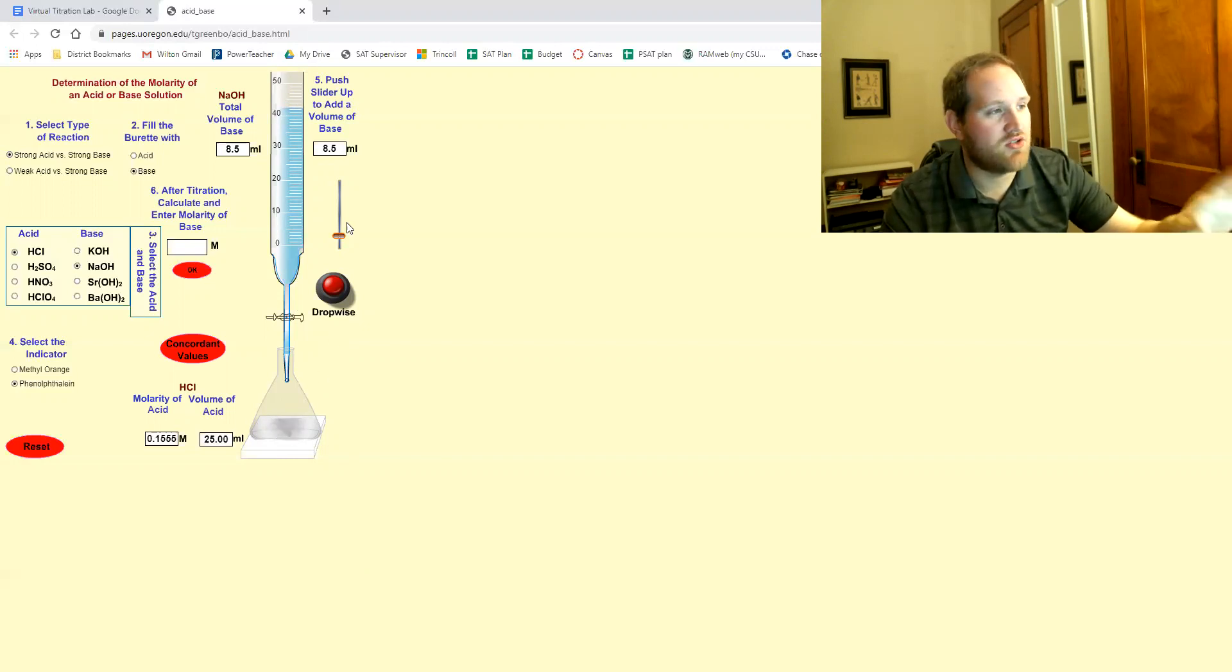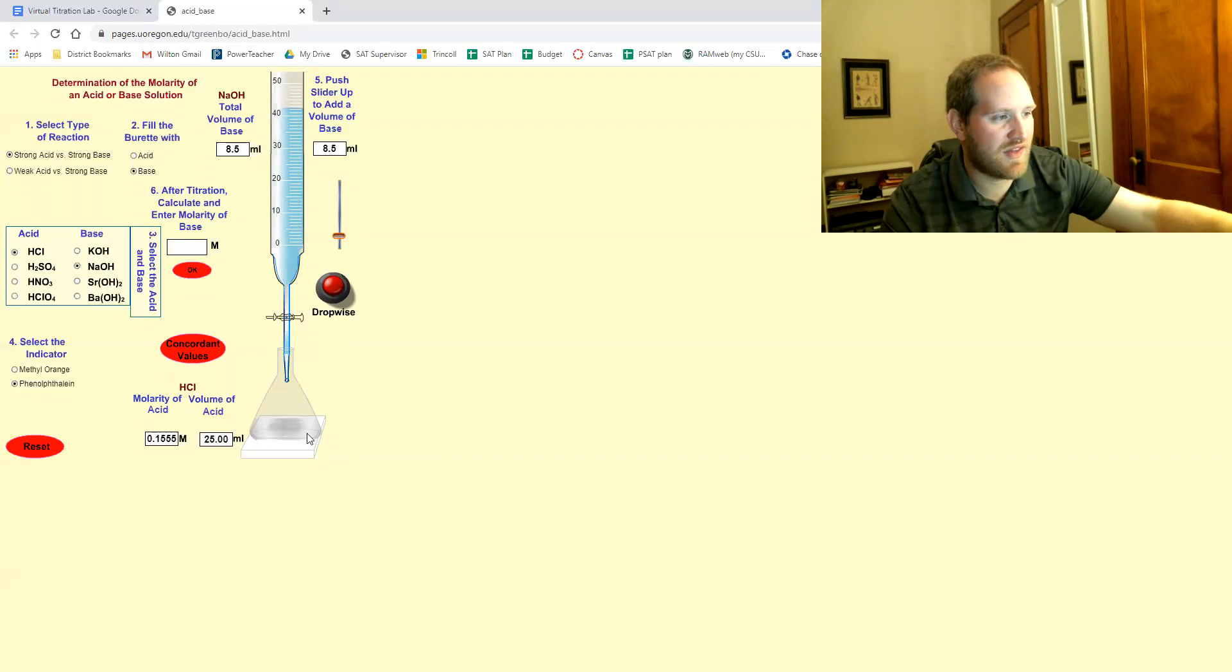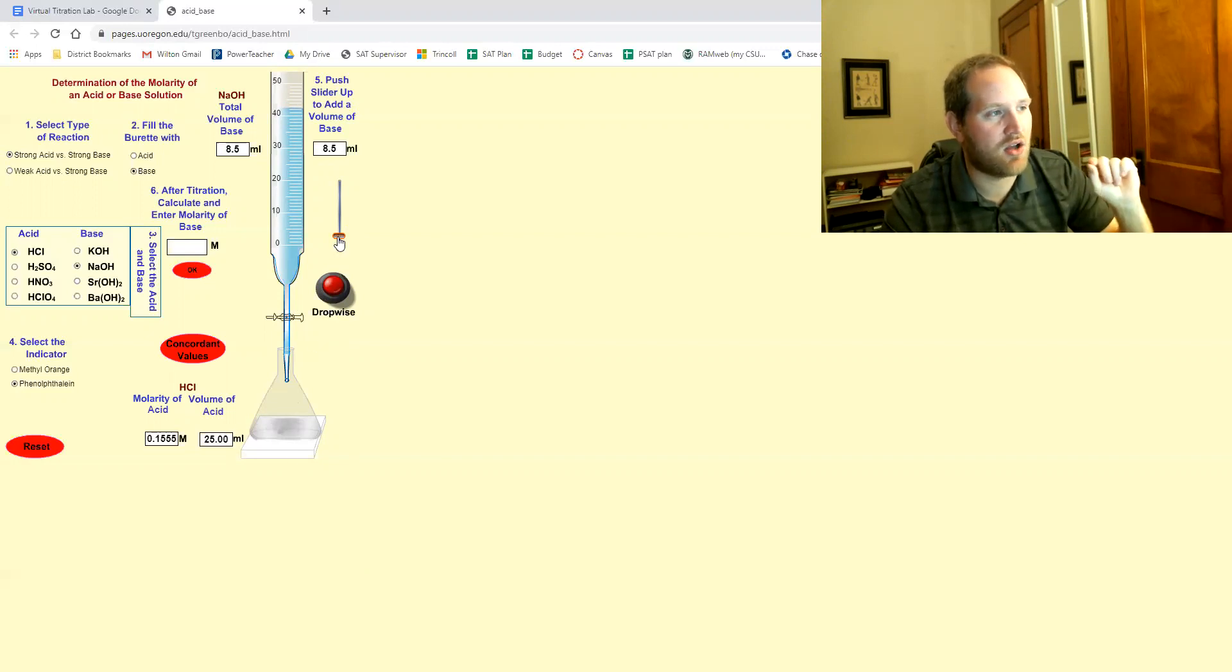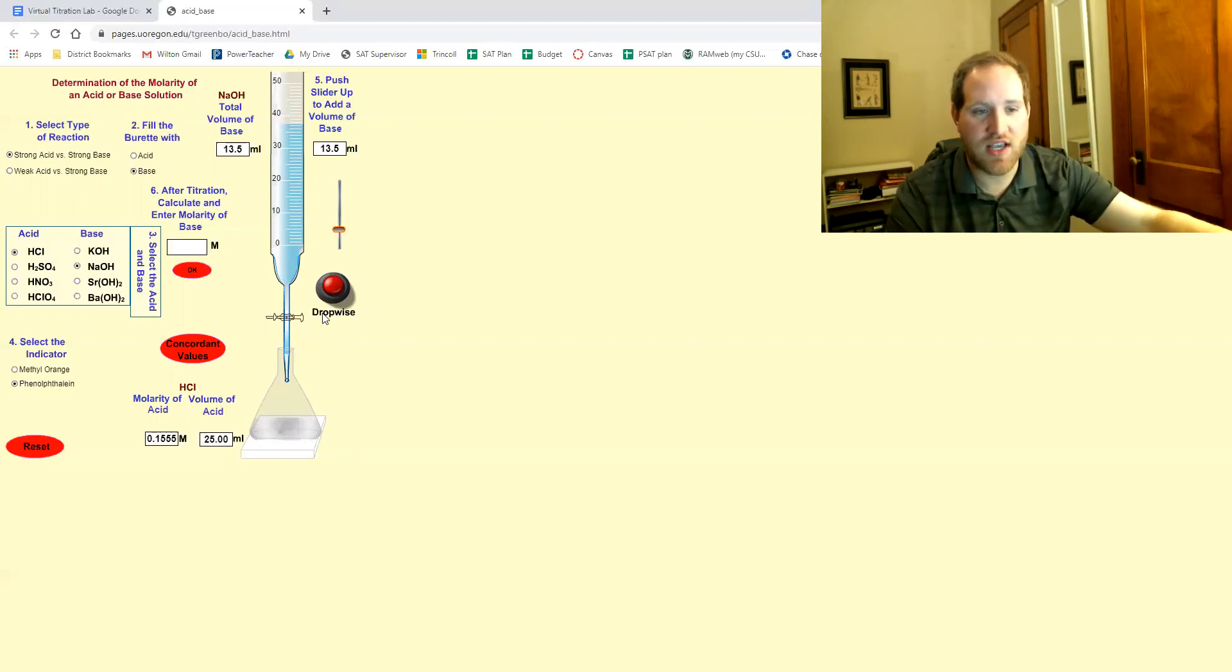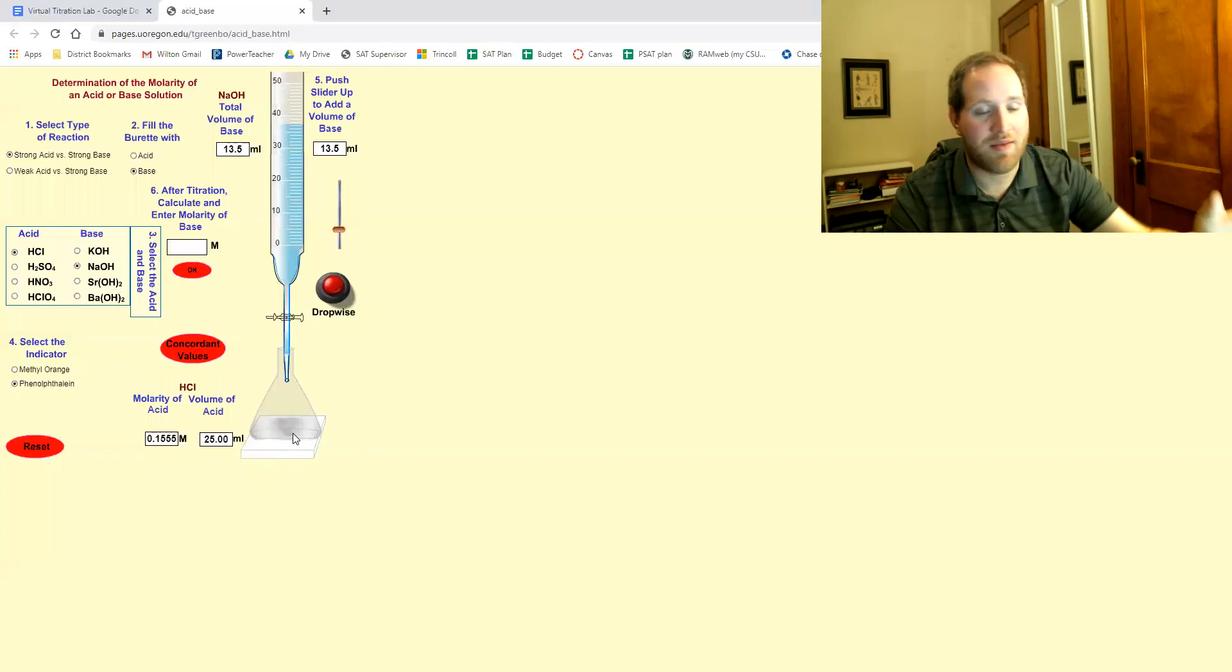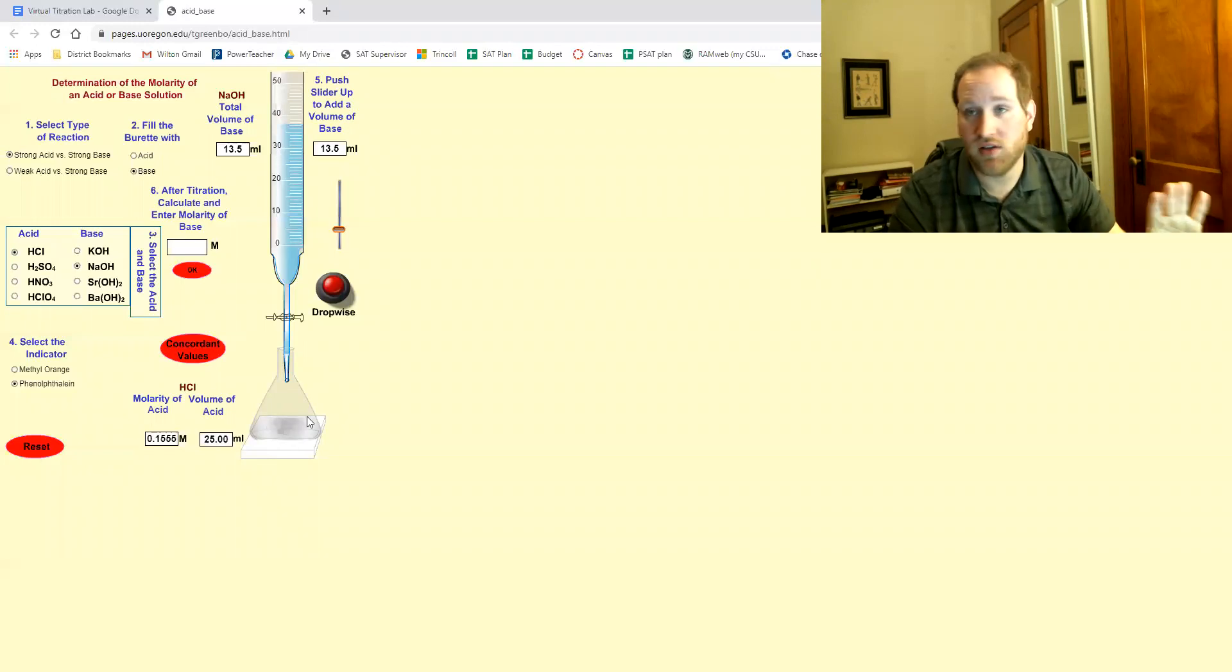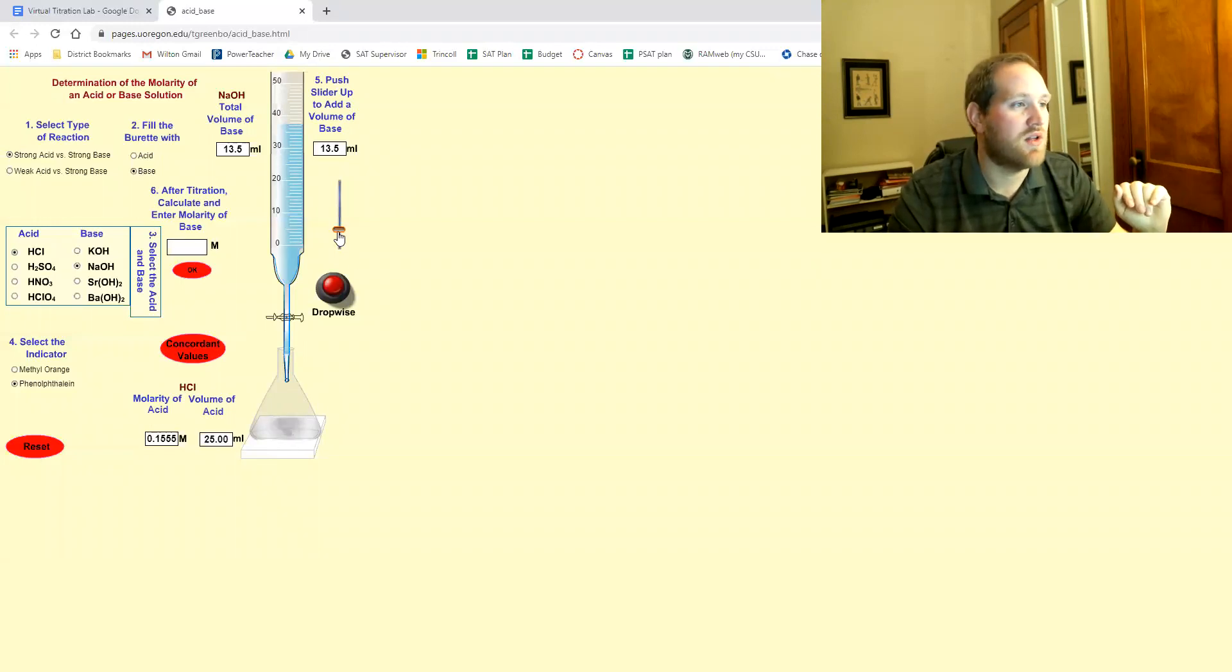Now I'm gonna do one more and I want you to look here at the flask and tell me if you see any color at all. I'm gonna drop another big amount. Now look at the flask. You see how nothing, there was no color? That means we're not even close. So let me add another big chunk again.